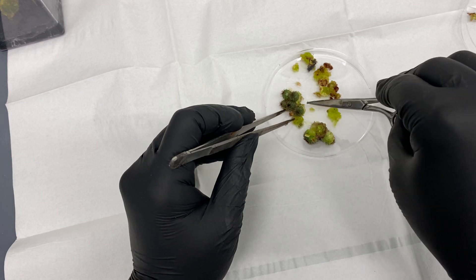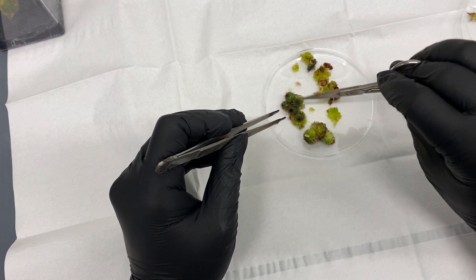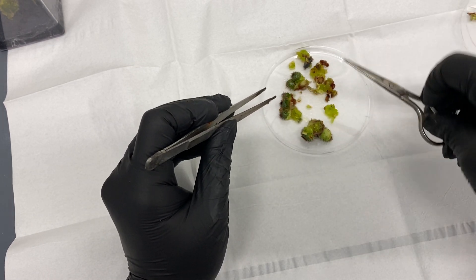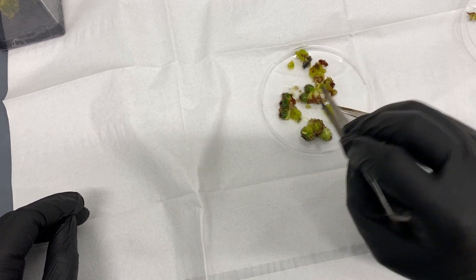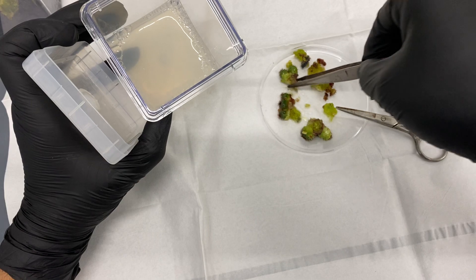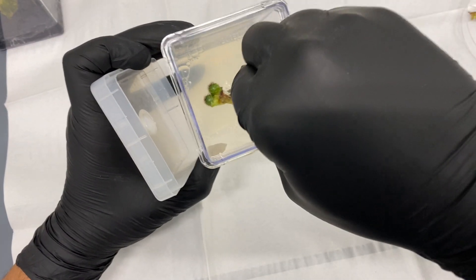By mistake I cut this in half, but no problem — stress including damage just helps plants grow even more in tissue culture, so these are probably going to grow even better. And I can maybe root this cluster separately.